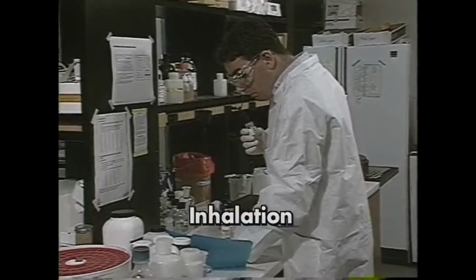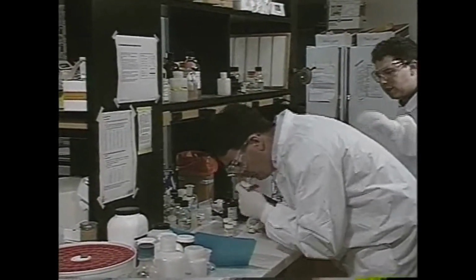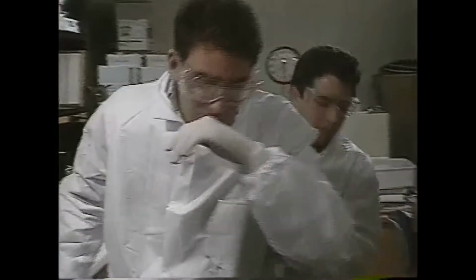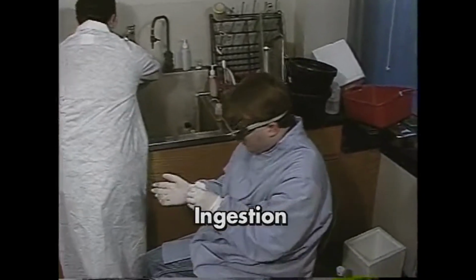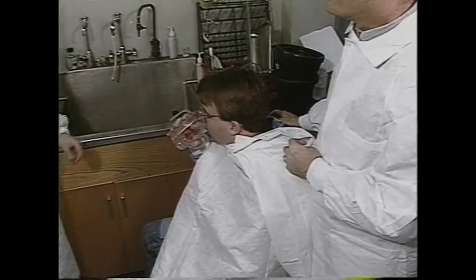Inhalation is another possible route of entry. If someone inhales hazardous gas, fumes, or vapors, the best thing to do is get that person out of the area and into fresh air. The third route of entry is ingestion. If someone swallows a chemical, consult the MSDS for instructions. They may need to take an antidote or drink water or milk to dilute the chemical.